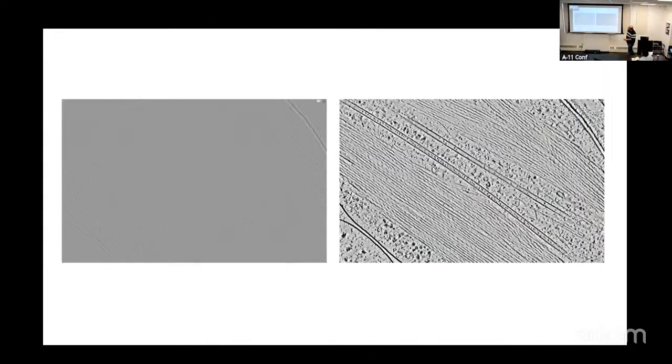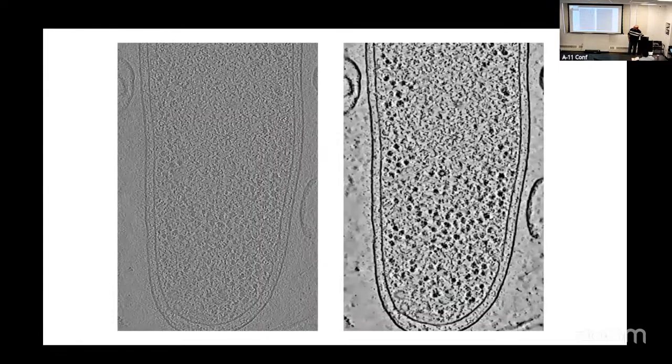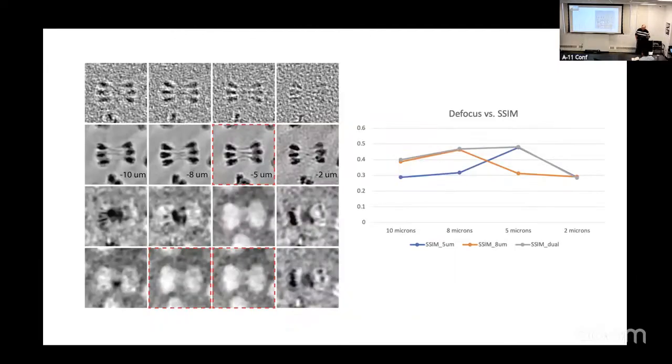What does it look like in practice again? So here is a slice through an axon. And these are bundles of cofilin-actin that form under stress, called cofilin-actin rods. They fill the cytoplasm in the axon, or the axoplasm, and they actually drive all kinds of transport dysregulation inside the neuron. But here's a single slice through that tomogram after it's been run through our denoising. Yeah, so it's denoised. Microtubules. Bacteria, right?